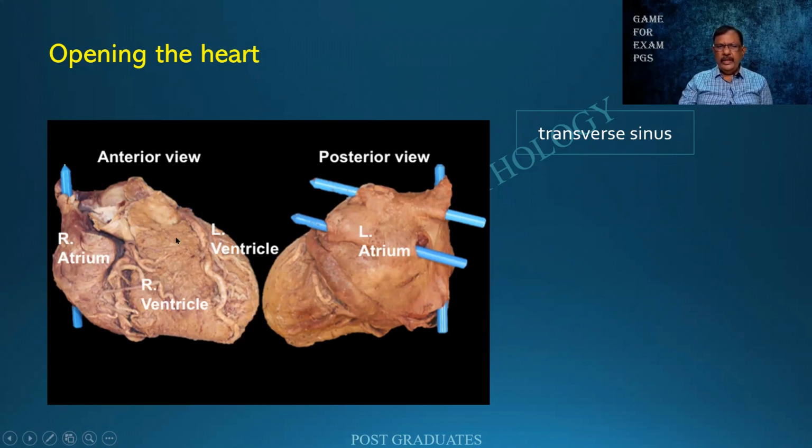And when I go posteriorly, I find that there is a left atrium. There will be a couple of veins which come into it, the pulmonary veins. Those also are being probed. And this is the probe between the superior vena cava and inferior vena cava. Care should be taken because when you put a probe, you may dislodge a thrombus. Sometimes it can be a malignant thrombus arising from a renal cell carcinoma, entering the renal vein, up the inferior vena cava, going up to the right side of the heart. That is why caution should be there.